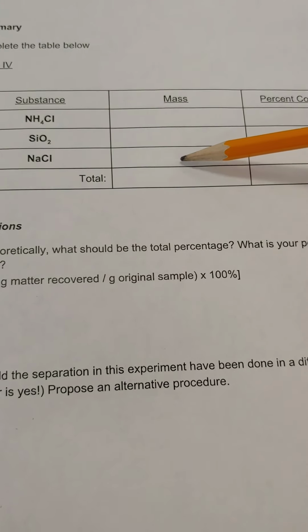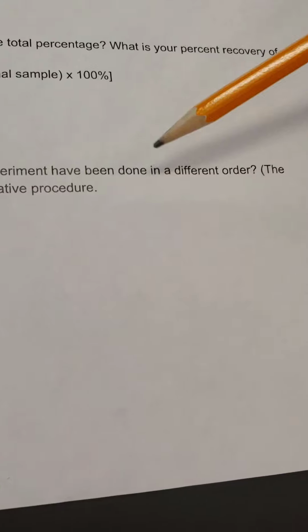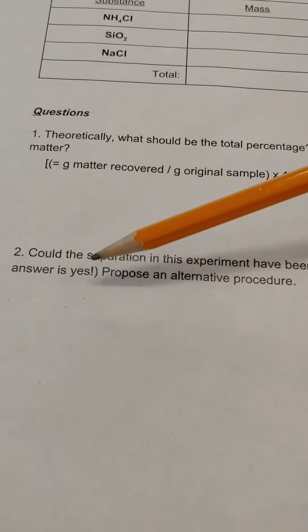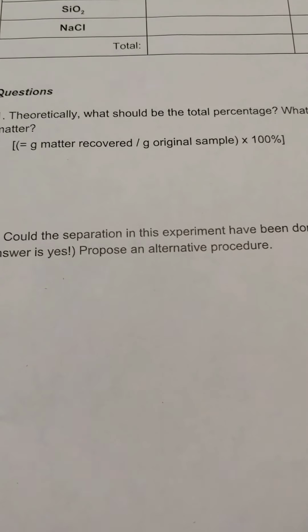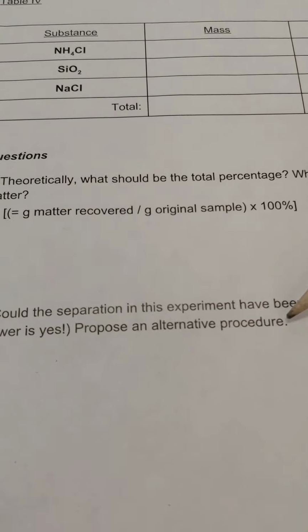The second question in the post-lab section says, could the separation in this experiment have been done in a different order? Well, the answer is not no. The answer is yes. You can't just write no and then move on to the next question. So I ask you to propose an alternative procedure.